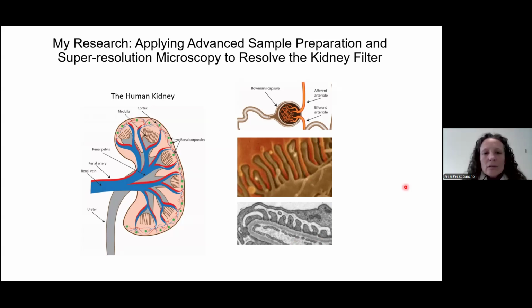I have a question. Are there tissues that are known to be recalcitrant to this expansion, difficult to expand? Yeah. Actually, the kidney is quite hard to expand, and that's due to there being a lot of collagen in some parts of the kidney. So very collagen-rich kidney can be hard to expand, and then you might have to use collagenase, for instance, to digest away the collagen.